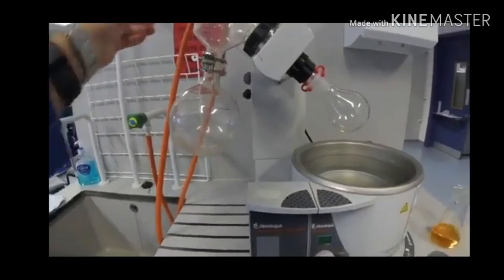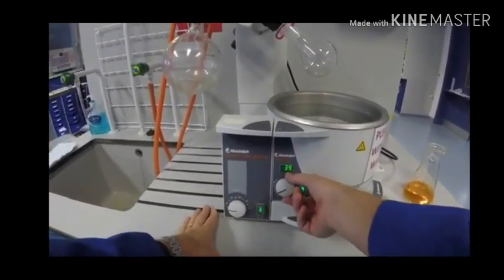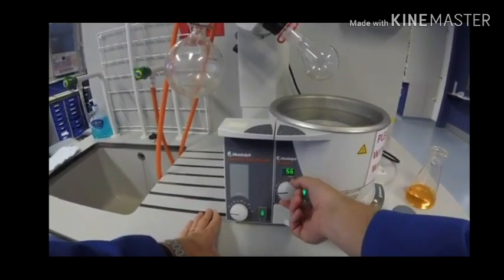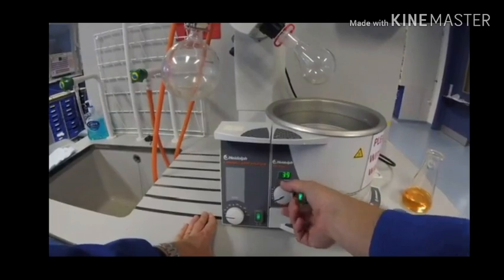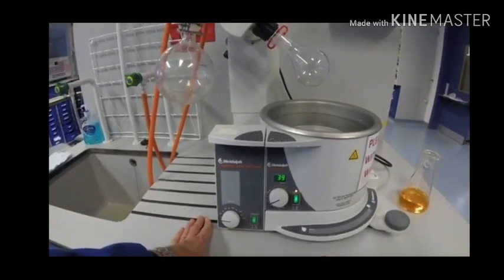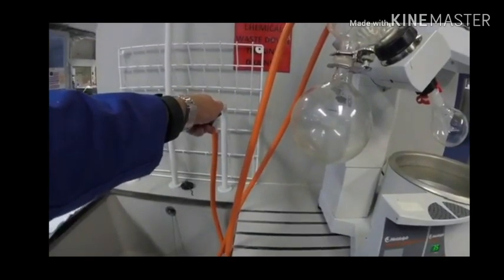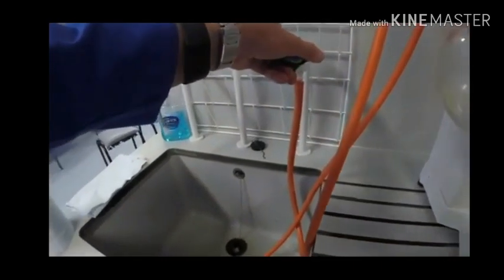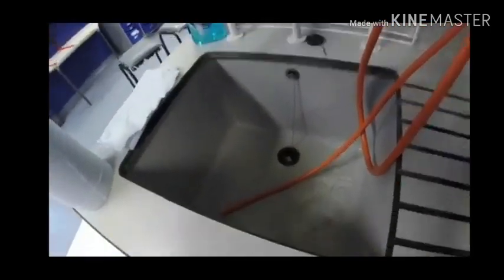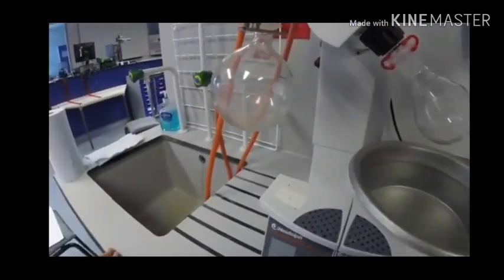In order to set it up, the first thing we're going to do is make sure we switch it on. And here we can then set the temperature. Essentially, for most organic solvents, we're going to want 40 degrees. That will do very nicely. And then we're going to turn on the cooling water. It doesn't want to be too fast, just running through the system.